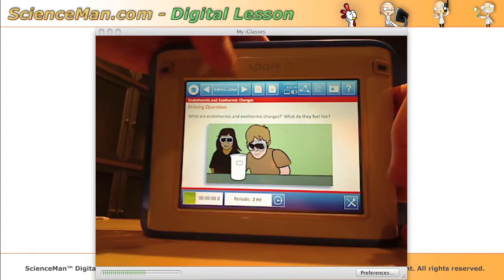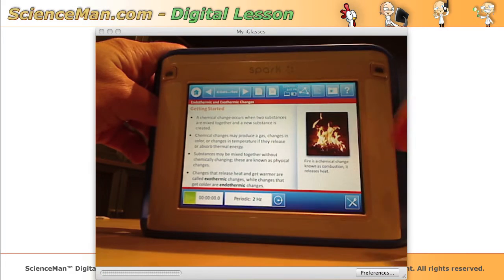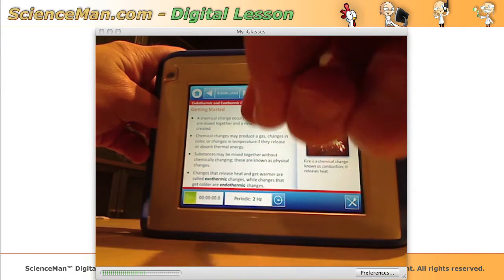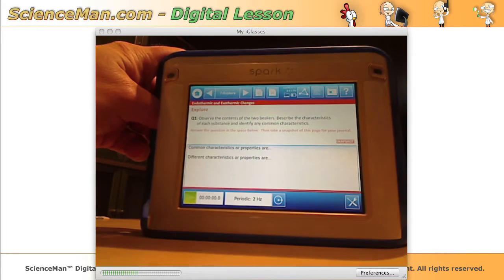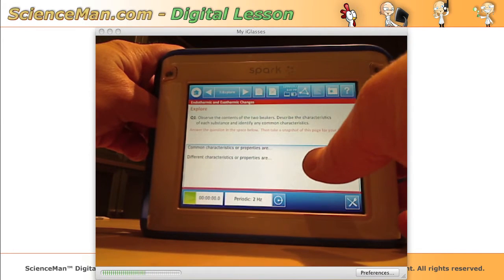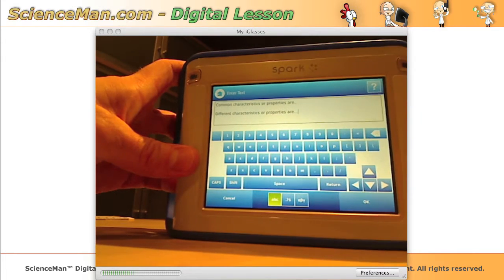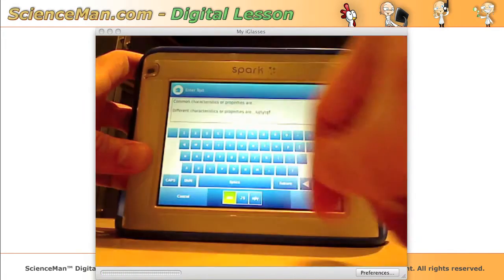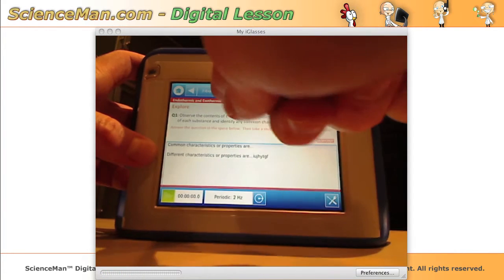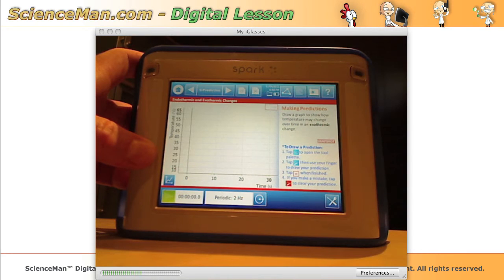After pressing proceed through the title screen, you get a question for your lab, then some background information, materials, and safety information. Then we can show off the ability for the student to interact with the SPARK, because when you get to an explore question and press on the response area, a keyboard comes up. The keyboard allows text entry so students can type their answers right into the screen and click OK to move on. It's very easy for a student to do a whole lab report and collect data within one of these pre-built experiments.